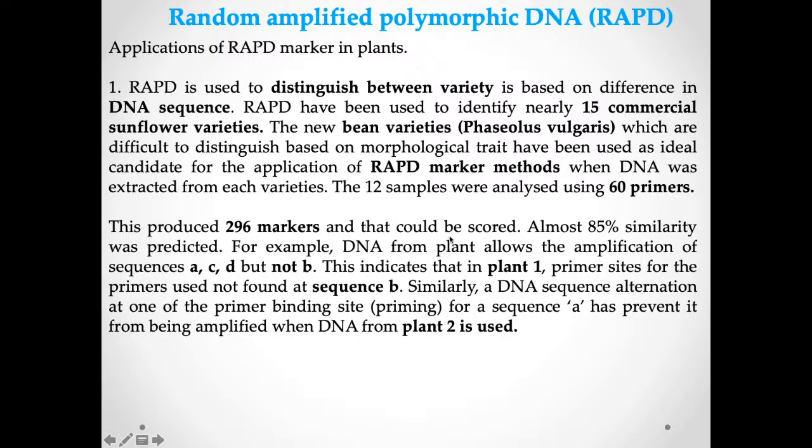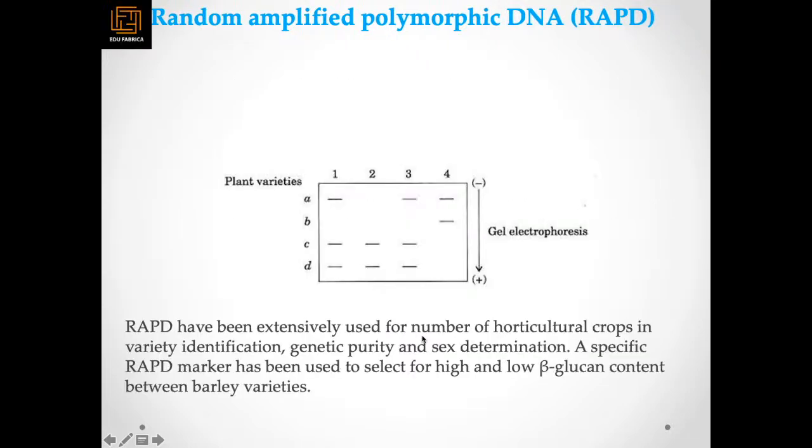Similarly, DNA sequence alteration in one of the primer binding sites can prevent amplification when DNA fragment from that plant is used. So it doesn't show anything in that part.